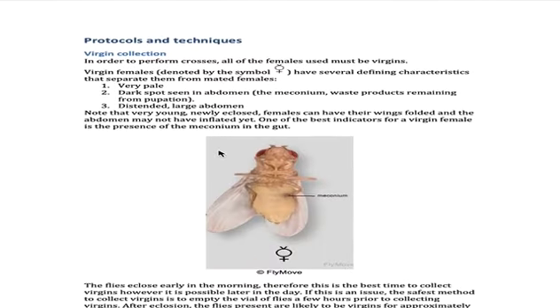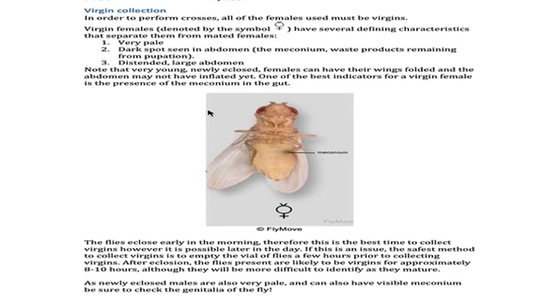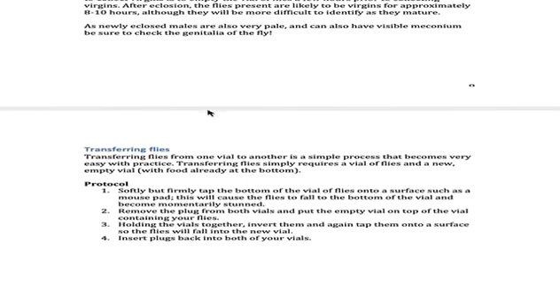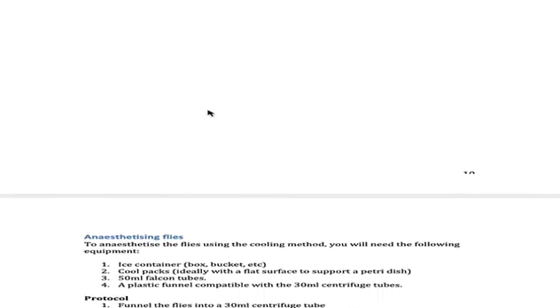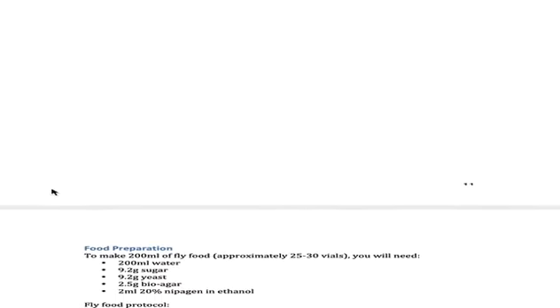So that's kind of it in terms of what you need in order to succeed today in lab. I'd of course encourage you to skim through the remainder of the document in case you ever want to work with fruit flies. You can put them to sleep. We have a fly nap, and I'd encourage you, if this is something that you'd like to do for your career, it's very easy for us to harvest some fruit flies from someone's compost pile, and you can practice anesthetizing them at any point during our semester, and seeing if you can sex them and identify any potential mutant traits.